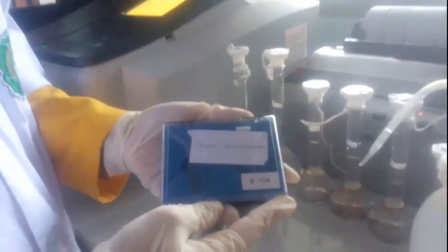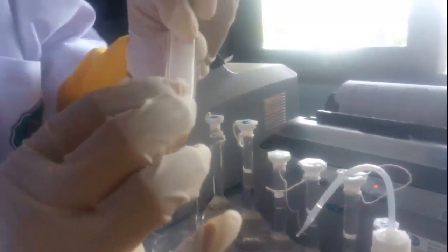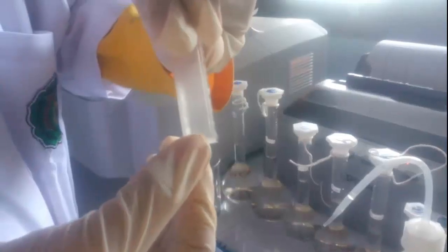This is the cuvette of the spectrophotometer. This is the clear side of the cuvette and never touch it with fingers. And this is the opaque side of the cuvette.